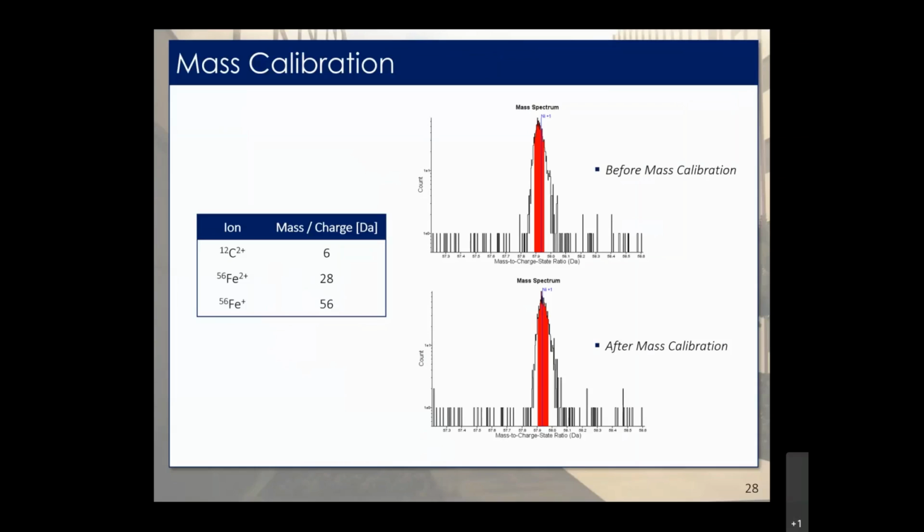Even if you have small shifts like this, it's important to do it that way. If you are looking at multiple data sets, especially with the same range file, everything should be exactly where it should be. You don't have to treat everything on a case-by-case basis.